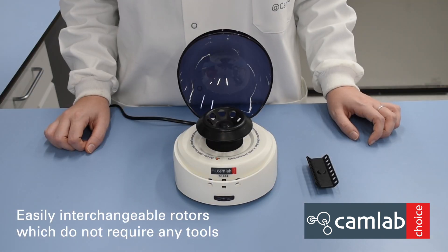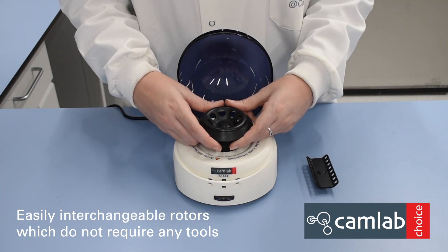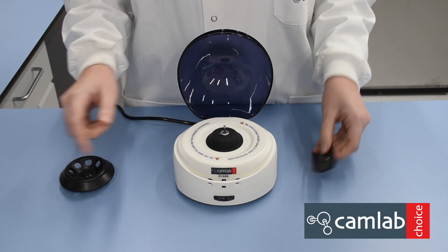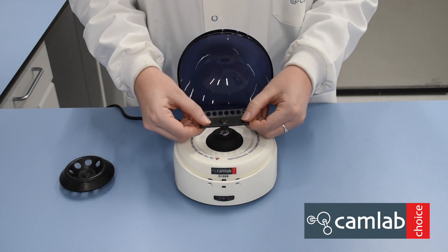To change your centrifuge rotor, lift the rotor from the centrifuge, and then place the new rotor on with both hands.